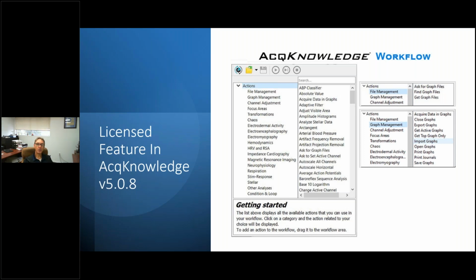For those of you that like to script, then scripting is an amazing tool that allows you to have full control over the system. But if, like many people, you just want to create a quick way to automate certain tasks, then workflow is really very elegant, completely drag and drop, and it makes life a whole lot easier.